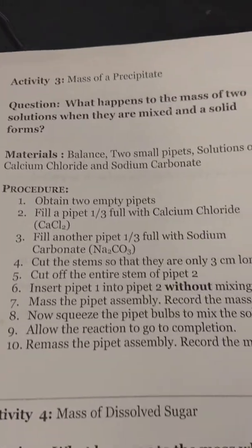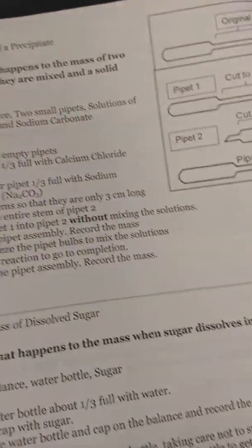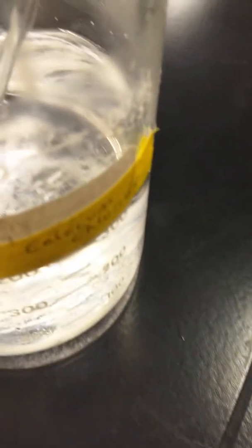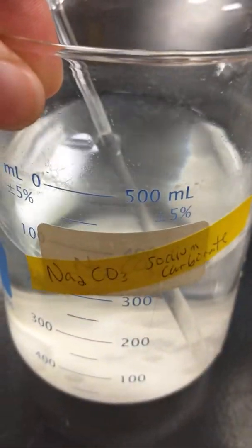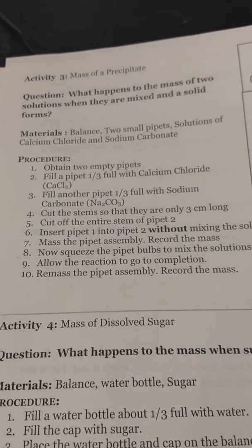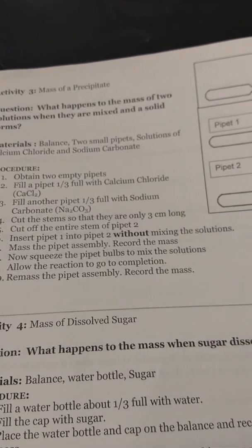All right, next one, part three. It asks you to get two empty pipettes, and then fill each one a third full with two different chemicals. One is calcium chloride and the other is sodium carbonate. Fill them up, then cut the stems so that one fits inside the other, and you'll see the reaction happen in a pipette.